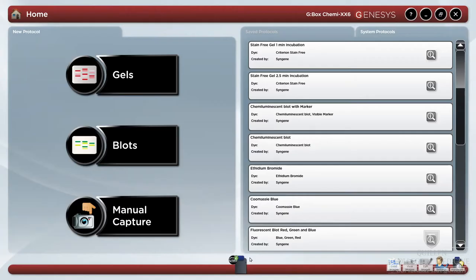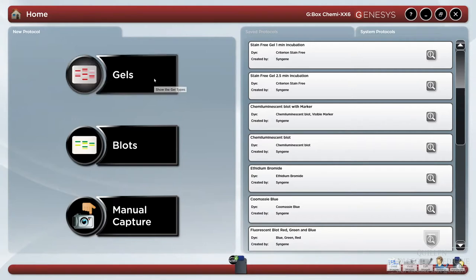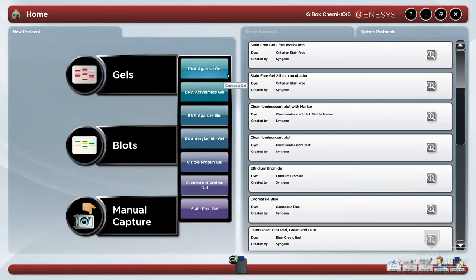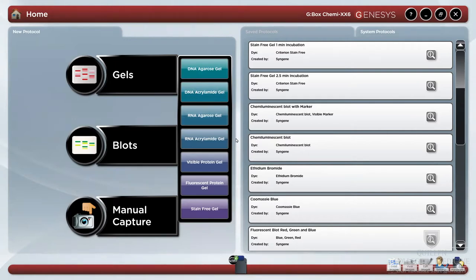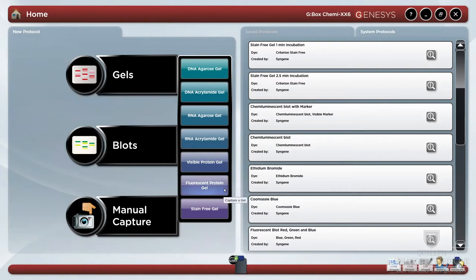The Gbox is capable of capturing images from a variety of gel or blot types: DNA agarose gels, DNA acrylamide gels, RNA agarose gels, RNA acrylamide gels, visible protein gels, fluorescent protein gels, and stain-free gels.